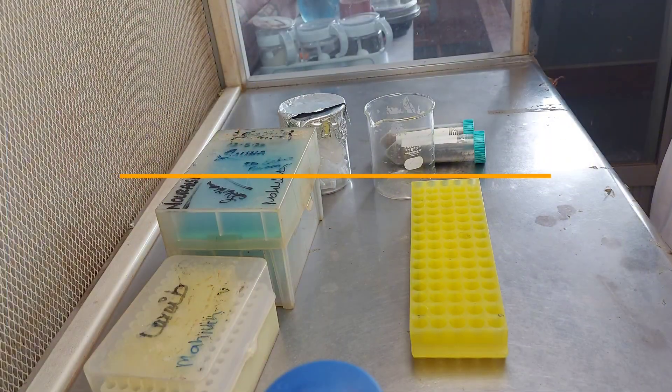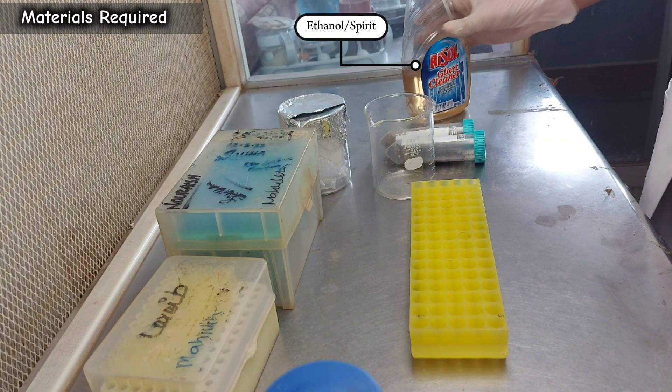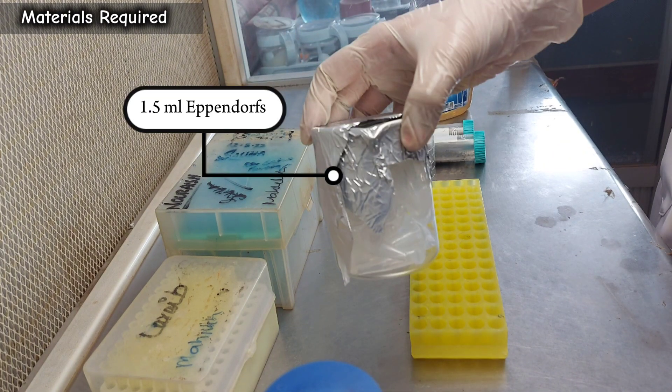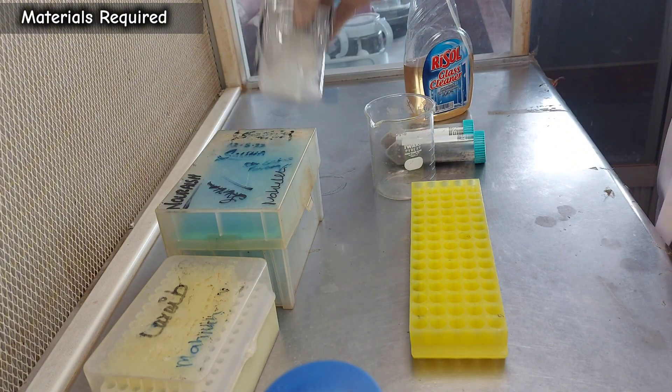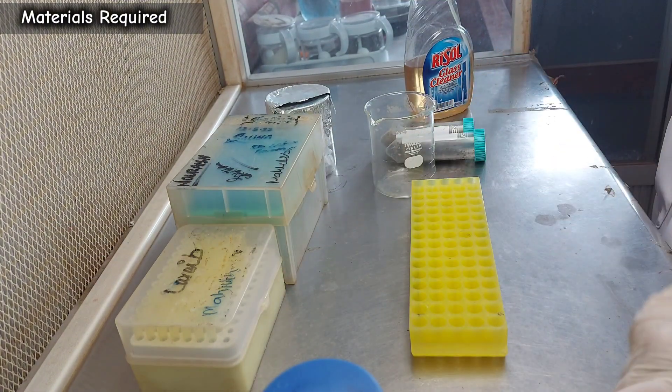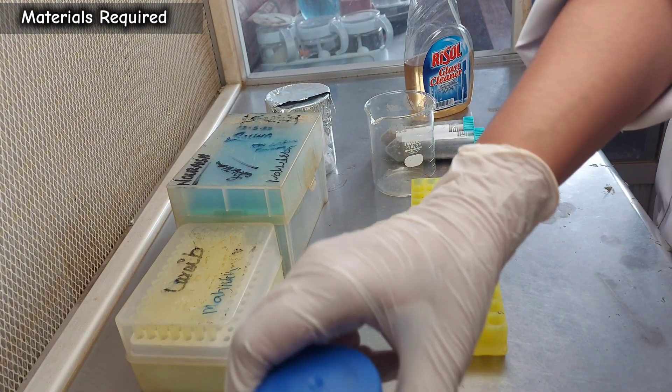To begin, ensure you have the following: sterilization materials such as ethanol or spirit spray, autoclaved 1.5 milliliter Eppendorf tubes, autoclaved blue and yellow micropipette tips, a 1000-microliter and a 100-microliter micropipette, and autoclaved distilled water.